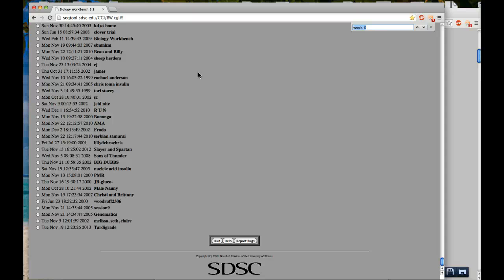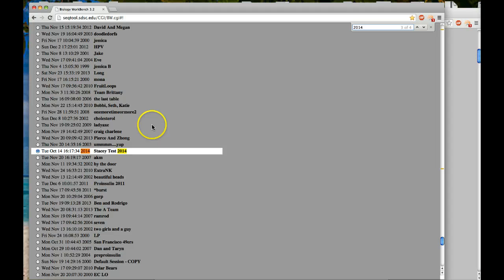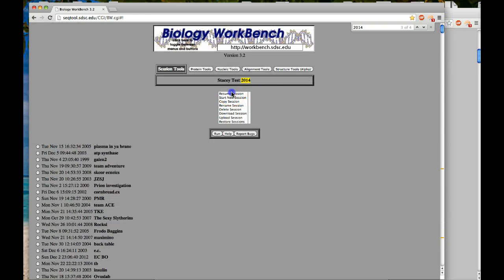I want to find 2014, I know was one of the words that was in my session. So I can see, oh, there's 2014 there. Next one, there was a caffeine test that I did just a couple days ago. And here's Stacy Test 2014. I can click that radio button right there, go up to the top and say resume session, and it'll make sure that I'm in that session when I hit run.